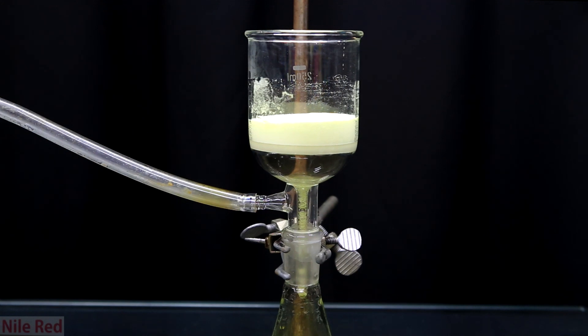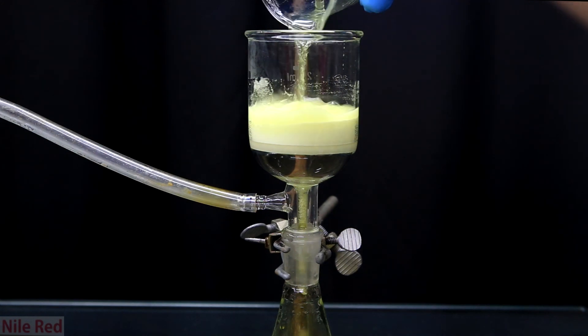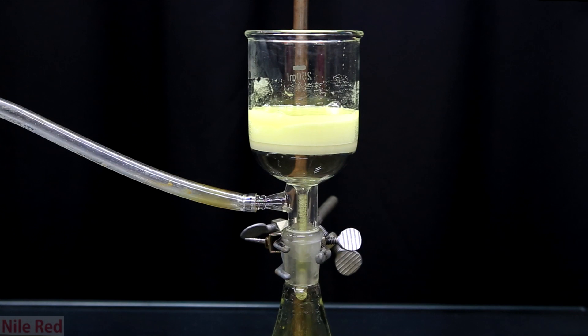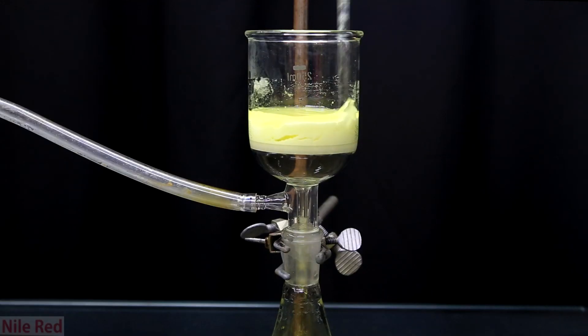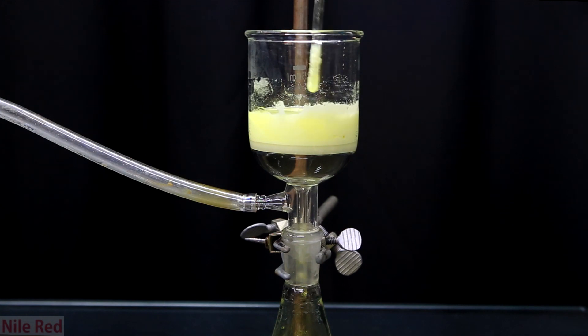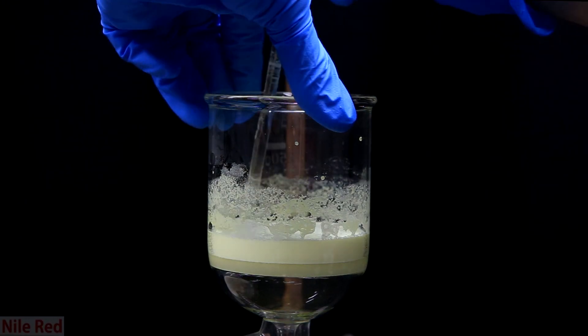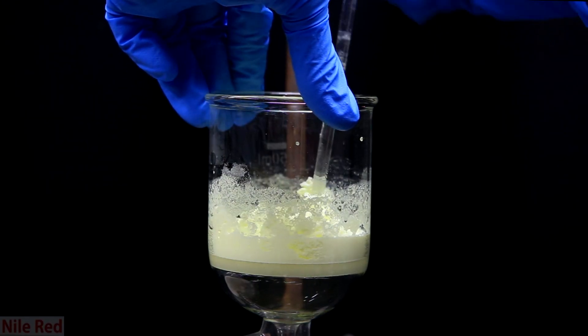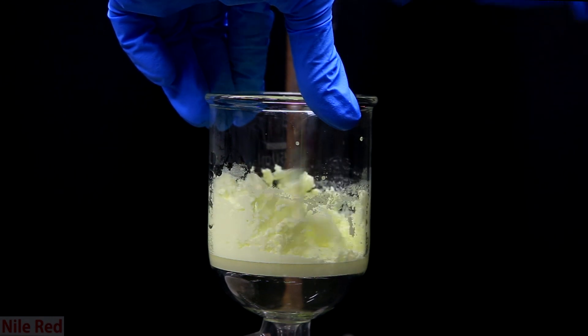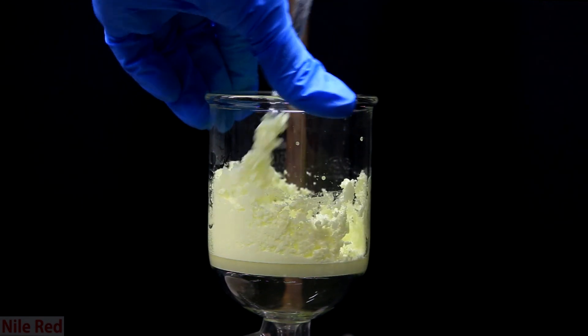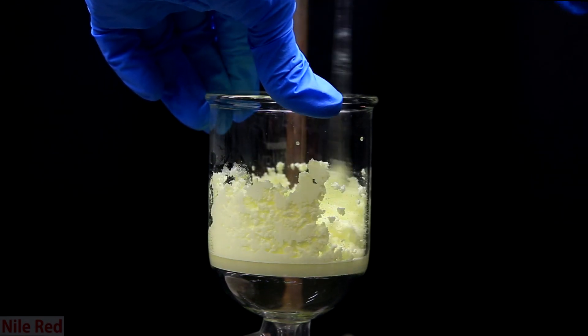The liquid is filtered through and the beaker that we transferred everything in from before is washed with a little bit of water which is also added to the filter. It's washed further a few times with some cold water just to get rid of any acid or 4-nitrophthalic acid that might remain. Afterwards, we keep pulling a vacuum on it to get it as dry as possible. Even after pulling vacuum on it for a bit, it was still pasty but that's okay.